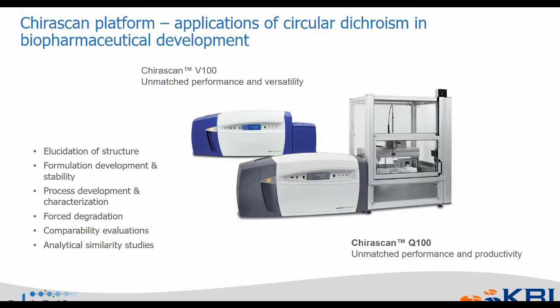Keith shared a slide similar to this a few minutes ago, demonstrating the Chirascan platform. In this webinar, most of the data that I will be presenting was obtained on a Chirascan Q100. We found this instrument to be a very powerful tool for collecting data both for protein secondary structure in the far UV and also protein tertiary structure in the near UV.